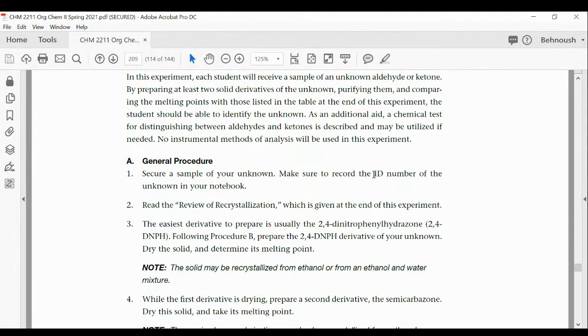And derivatization is a process that you can do. When do you use derivatization? It is the case just like experiment 12, when you had 2 or 3 boiling points that were very close to one another, so boiling point could not help you to identify your compound.